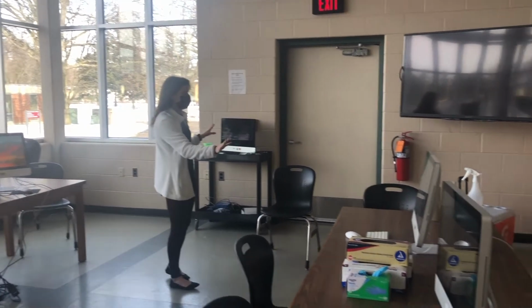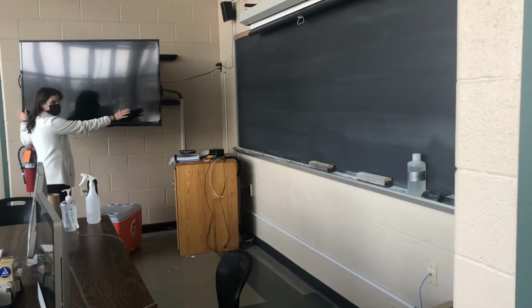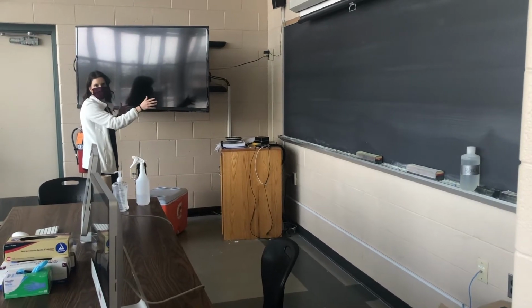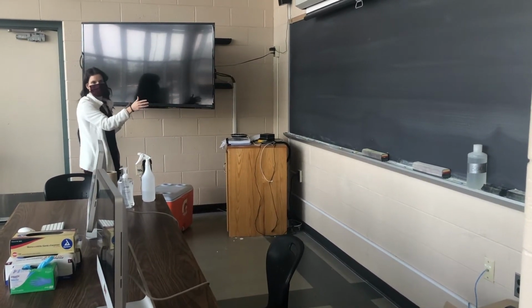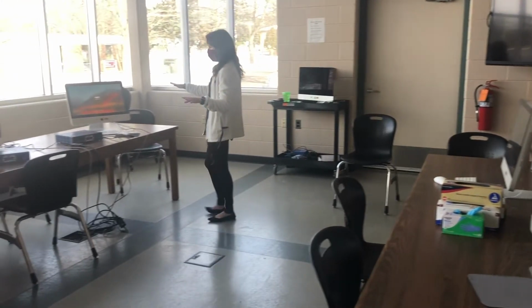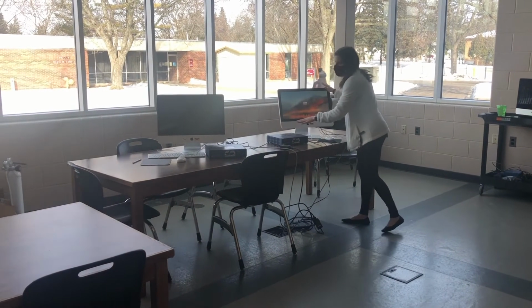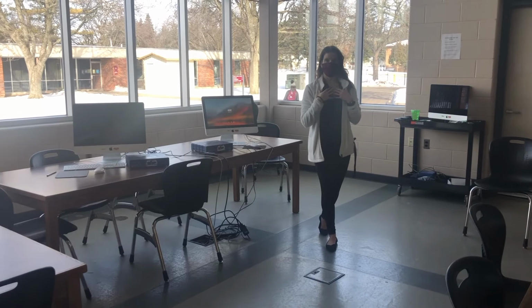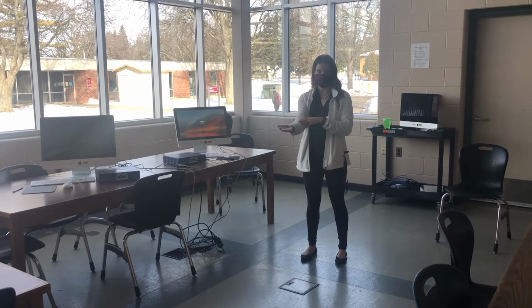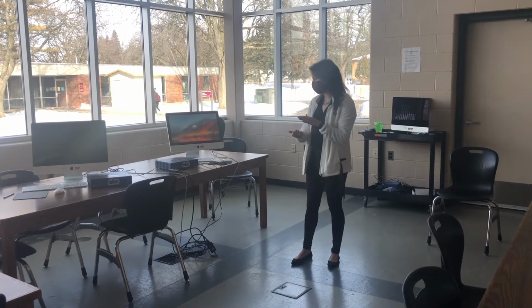Now this area is a seating area. You can see that we have a chalkboard over on the side, and we have this big screen TV. We use this for journal clubs that we have on Fridays during the months, where students can come and talk about current research or present the research that they're doing. At these tables, we also do the majority of our physiology labs. So we normally will have 4 setups where we have a computer and BioPac systems that allow us to measure different physiological variables, such as lung volumes by breathing into a spirometer, or looking at heart rate, or how quickly we can react to a stimulus, so nerve conduction velocity or reaction times.